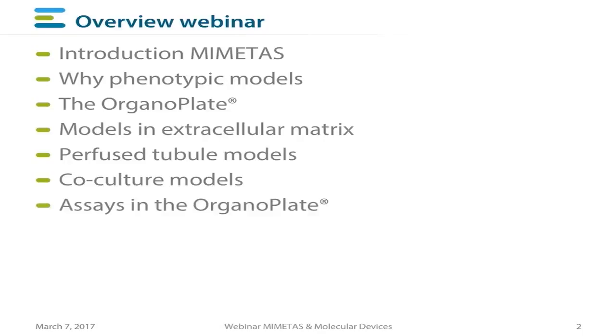Then I'm going to show you some of the assays that we developed in the OrganoPlate that allow you to interrogate the models that grow inside the plate. And I'm going to finish up with a summary of this webinar. After the webinar, there will be ample opportunity to ask any questions.